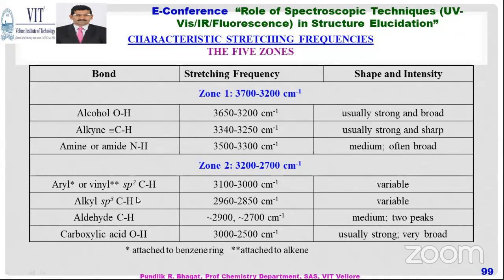You will know if you see some 10 or 15 spectra how beautiful it is. The only thing is, before taking the IR spectra your compound should be crystallized 2 times, or if you are recrystallizing or purifying 3 times, you will get such a nice spectra. You will enjoy the spectra and feel happy: yes, my compound is very pure. Only your compound should be pure.